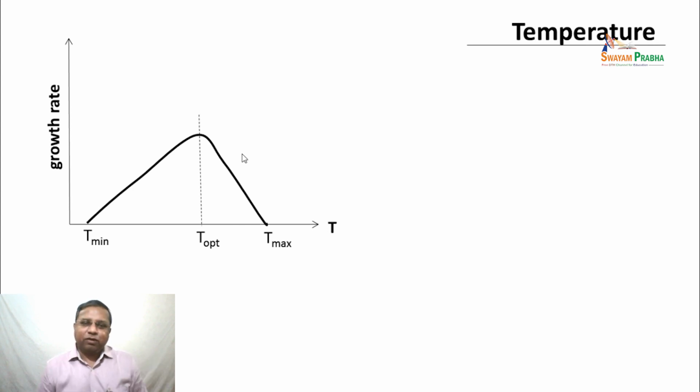Therefore, the overall productivity from the bioreactor will go up. If you are looking at these strategies, the temperature-based strategies, this information becomes rather crucial, and these have already been done. They have also been used in the industry, the temperature shift strategies.